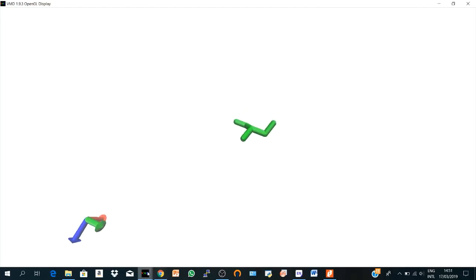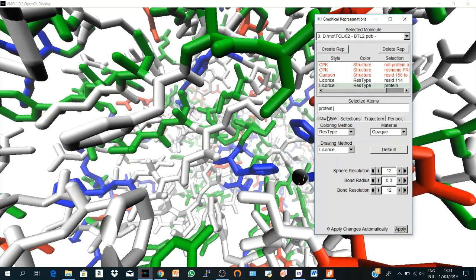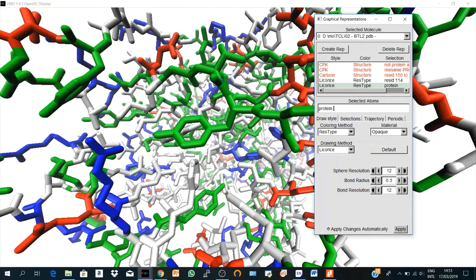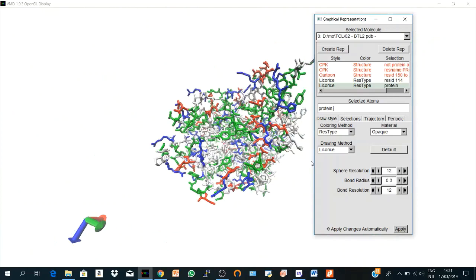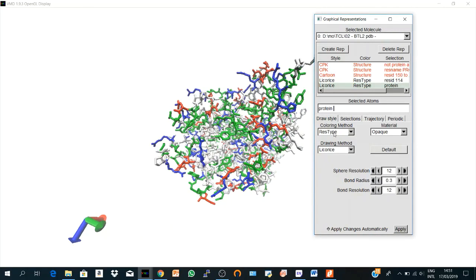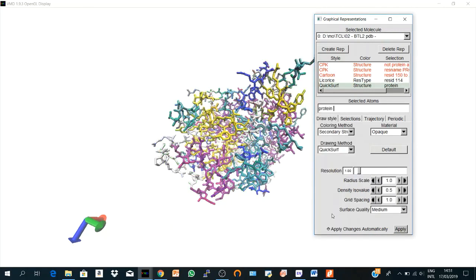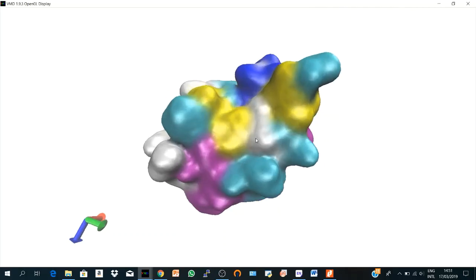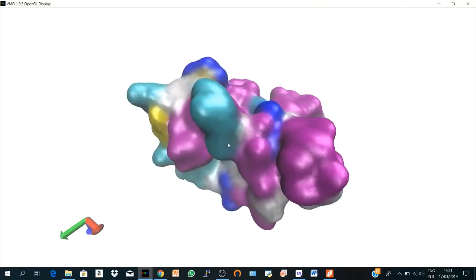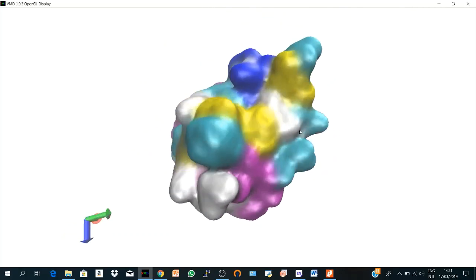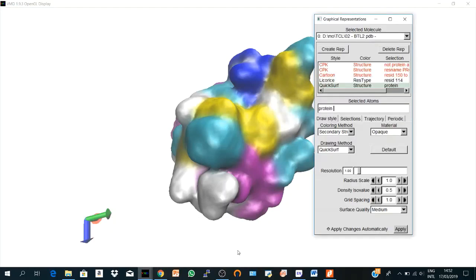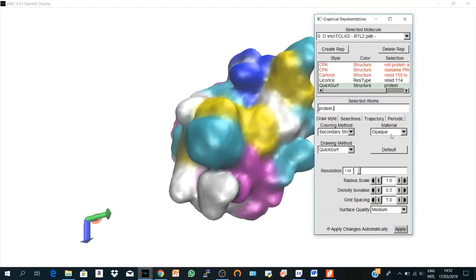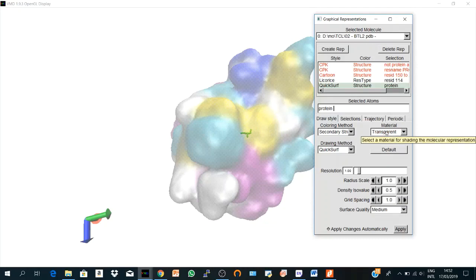And let's create another surf representation. And I say protein, enter. Let's get a little bit back, zoom out. And I say as secondary structure and QuickSurf. Here you don't see anything. But here comes the importance of the material. If I set transparent, I see my active site. So that's why now we understand why transparent is important.